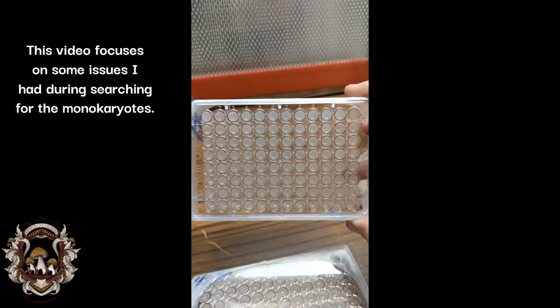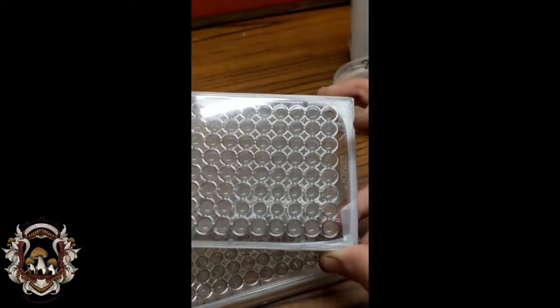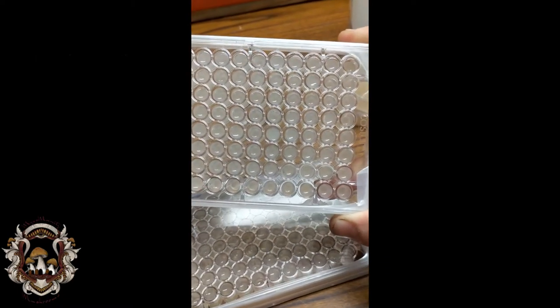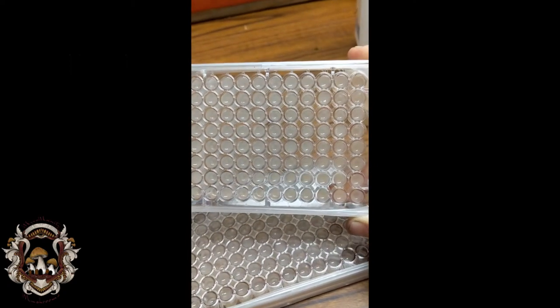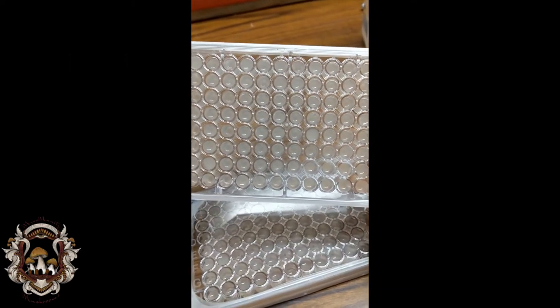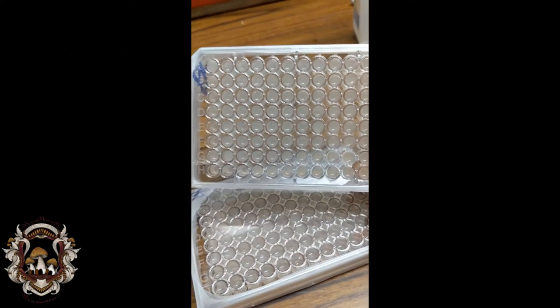What up, guys? So we're back in here once again looking at these microplates. These are the ones I suspected to be sterile. They are commercial genetics. And as you can see, this is completely clean, it seems, apparently.